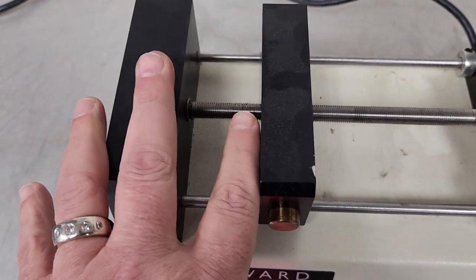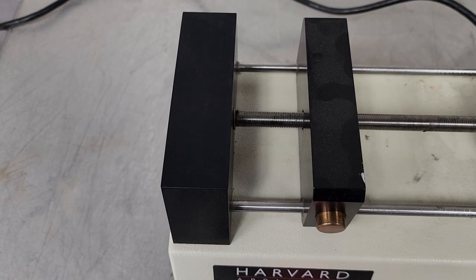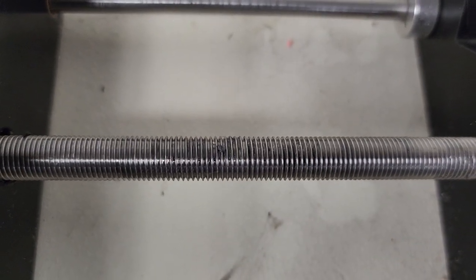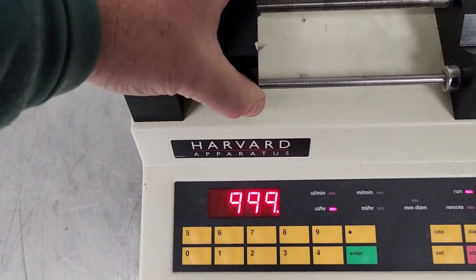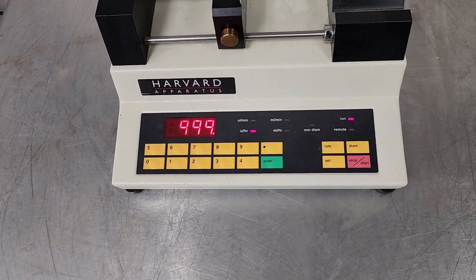That's what I was trying to do, see, because maybe I could show you that, you know, that it's turning. Yeah, you can kind of see that. But this is adjustable. This goes back and forth. Wherever it grabs, and that'll do the pump.